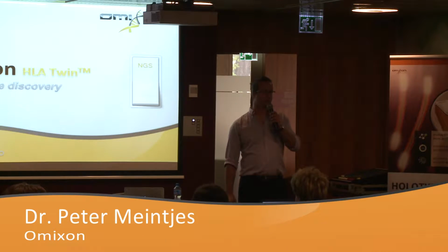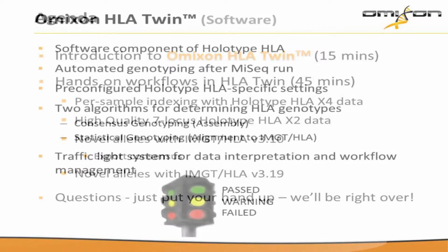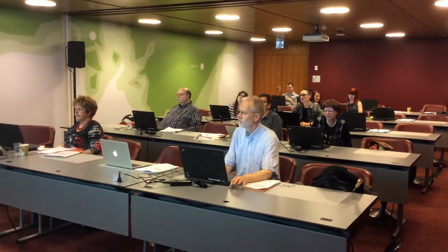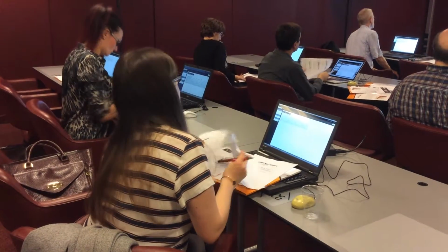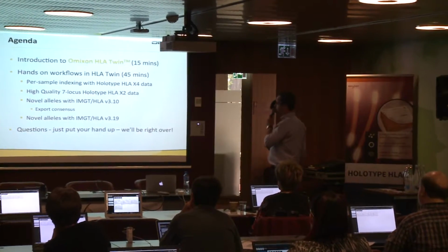Welcome to the Omixon workshop on novel allele discovery. I'm going to introduce you to the software component, and then you're actually going to get to work independently. You have a worksheet in front of you. You're going to basically answer all the questions and follow all of the instructions that we have, working your way through them as you go.